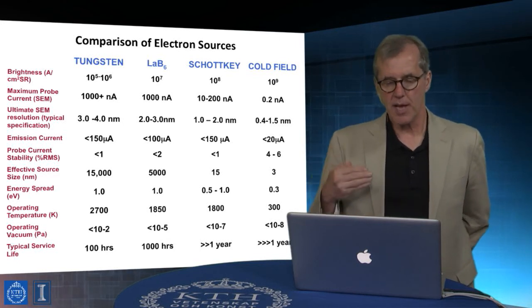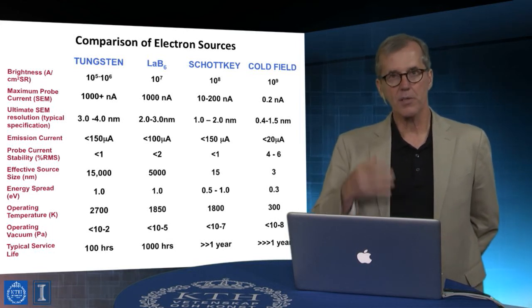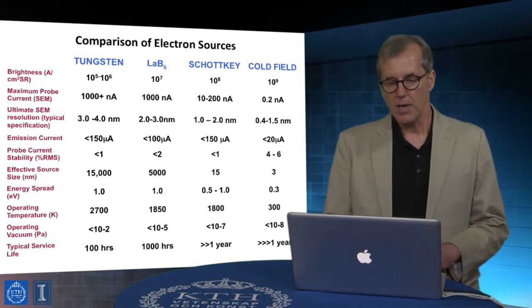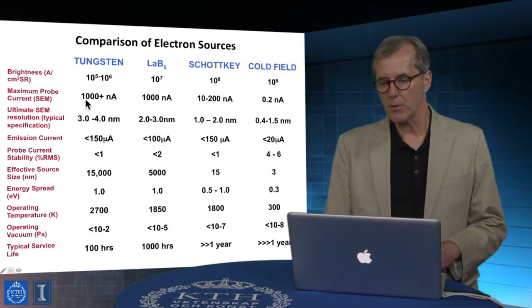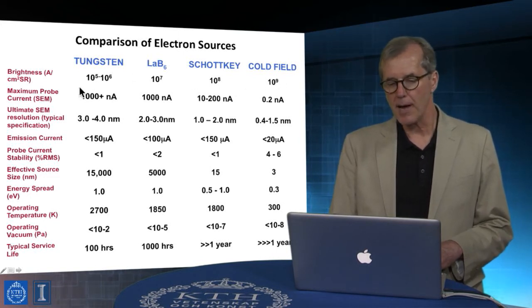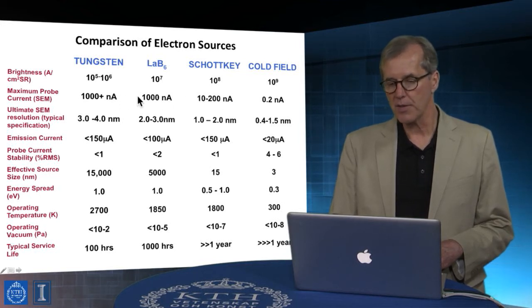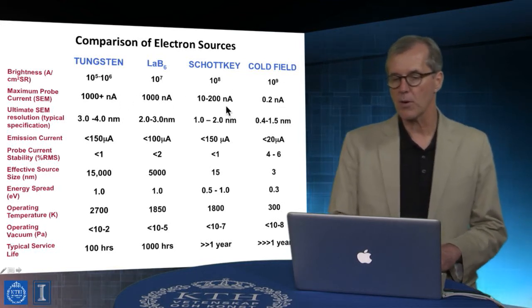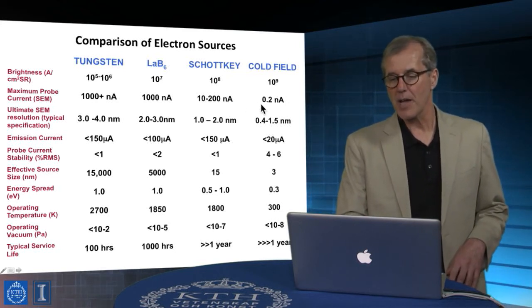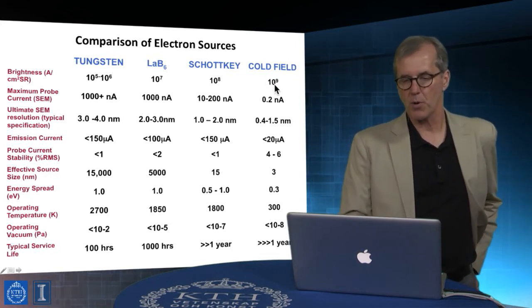It's not just that there's more electrons with one versus the other. It's electrons per unit area in the cross section, and you can actually see that from the point of view of electron densities provided in the top versus what the total currents are, thousands of nanoamps down to fractions of a nanoamp, but the ones over here being the most high spatial precision instruments, where there's lots of electrons per small unit area.